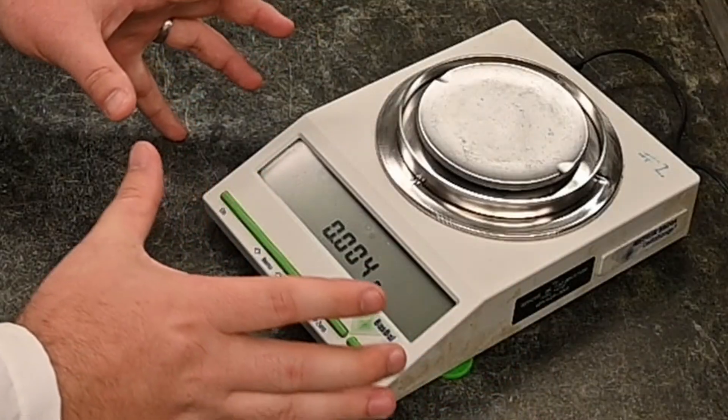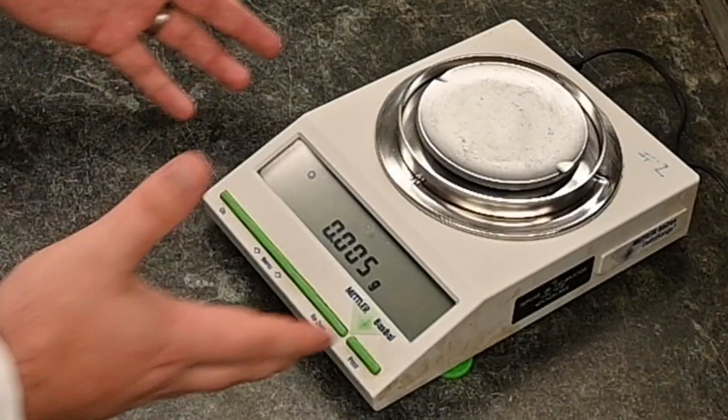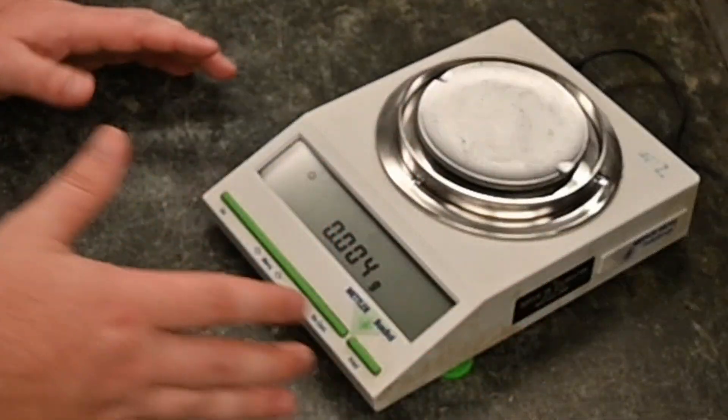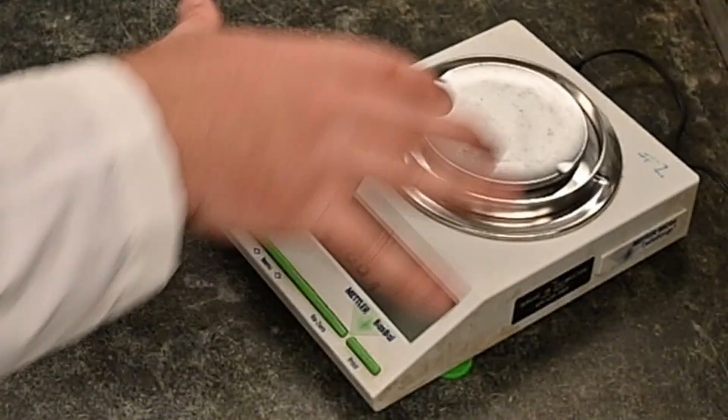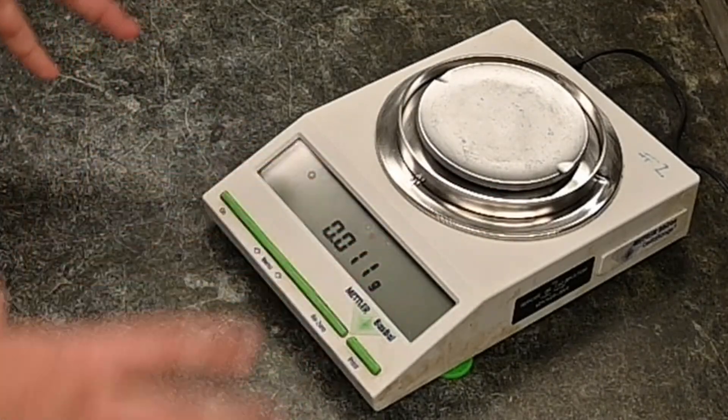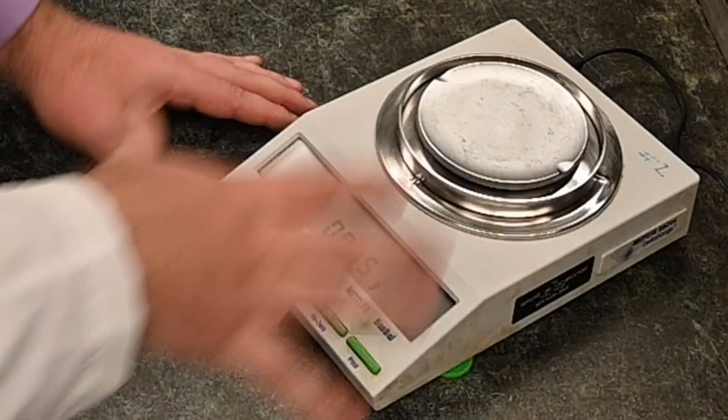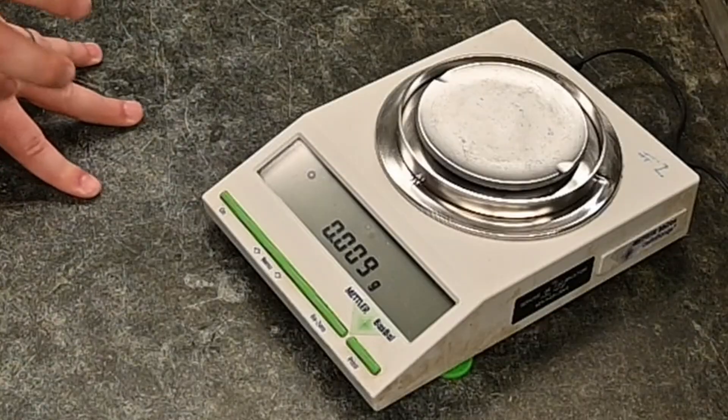One thing you have to worry about with these fancier electric balance scales is that they have a level on it. And the reason is they're so sensitive that even being a little bit off level can cause there to be error. So they actually have these little adjustable feet on the side that you can actually go through and get it right. It probably will already be balanced for you.